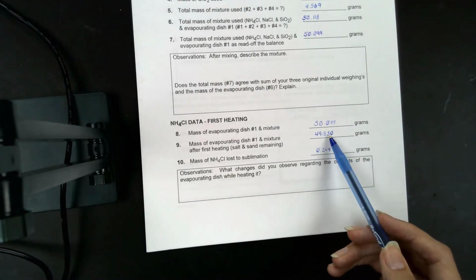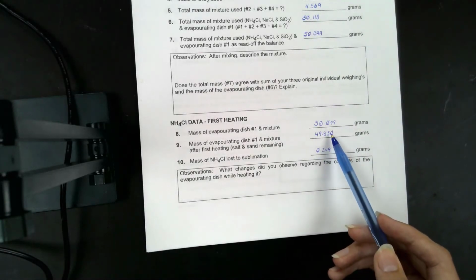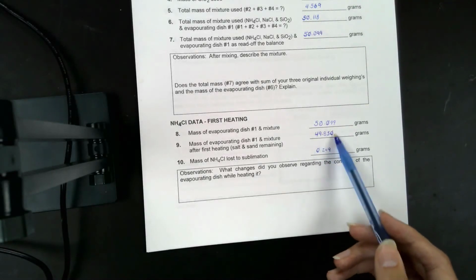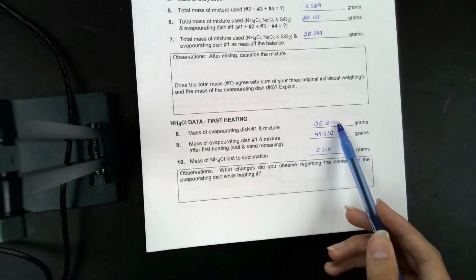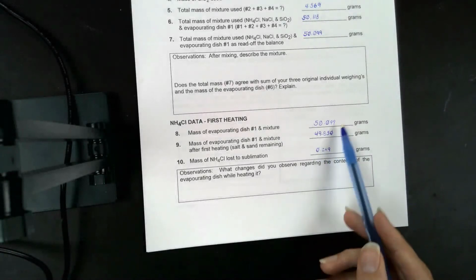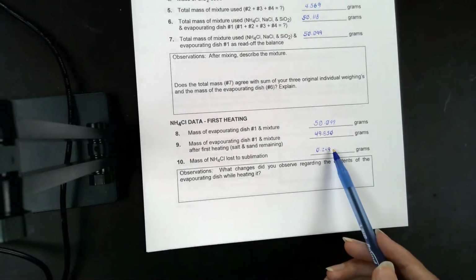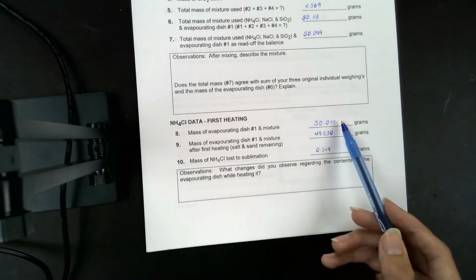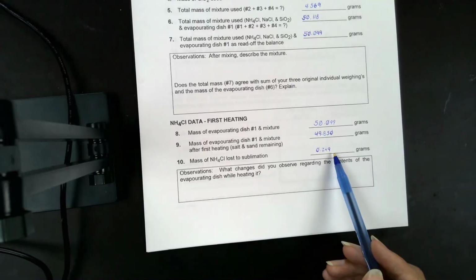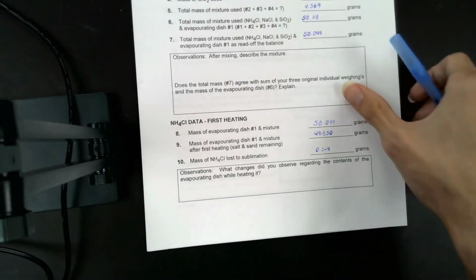Item number 9 is the mass of that same dish. It's the same one I started with after heating it. So this is the mass of everything left after I drive off the ammonium chloride. This is the mass before that. This is the mass after that. So the difference between the two is the mass of ammonium chloride I lost as I heated. Okay, I started with this. I heated it to drive off the ammonium chloride and got this. And so that difference is going to give me the mass that I lost to sublimation.